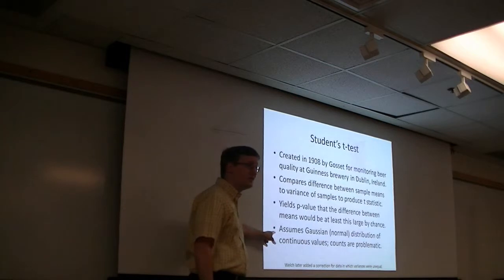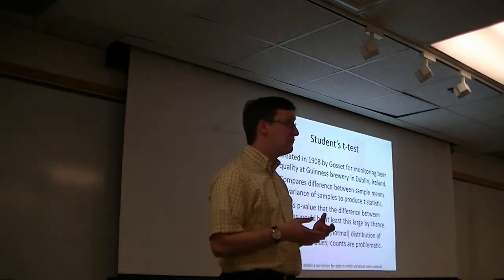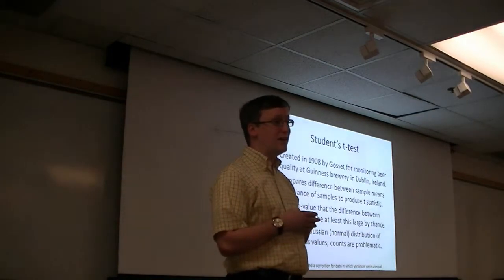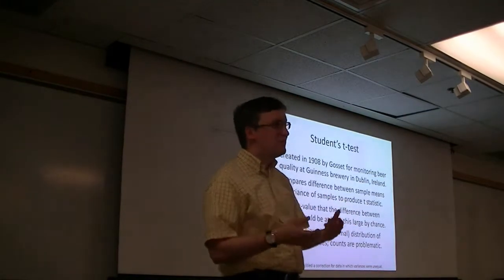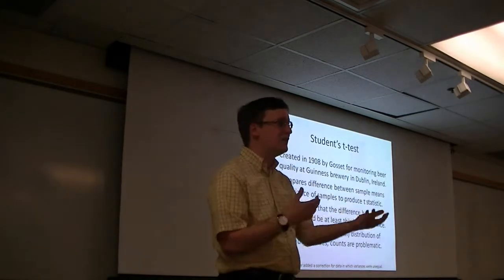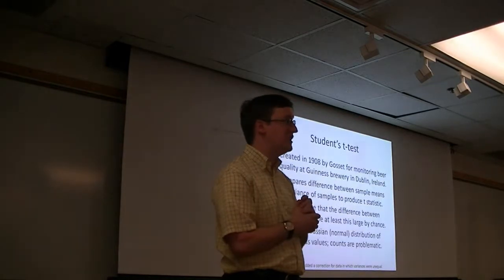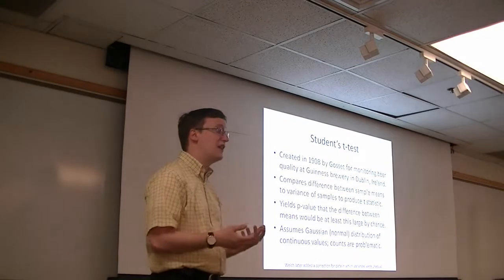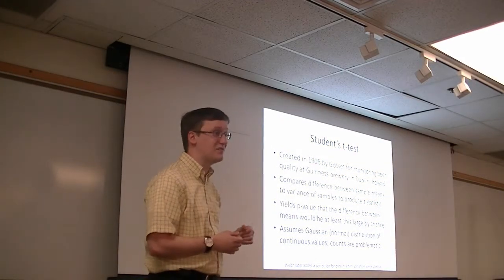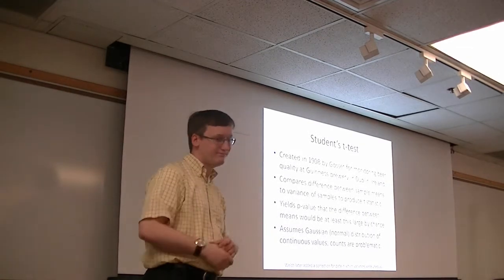However, it assumes normal distributions in the data that we've seen. Now, normal distributions are a pretty good bet in most cases, because when we have lots of factors contributing to variability, we assume a kind of normality in the result that comes out of it. But there are certainly some cases in which the variation that we see in these intensities is not normal. And if you have a case like that, you can't do a t-test against them, because that will give you a misestimated p-value.